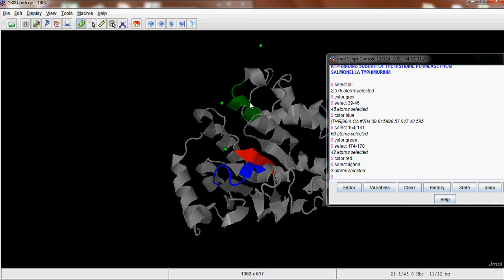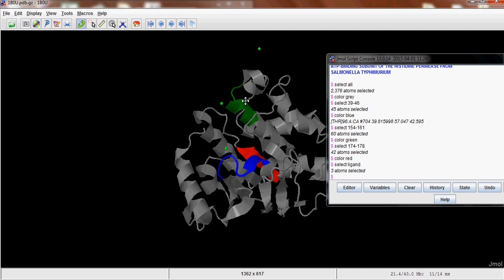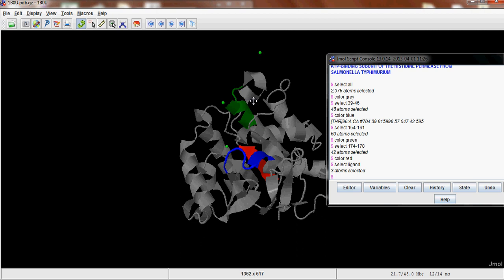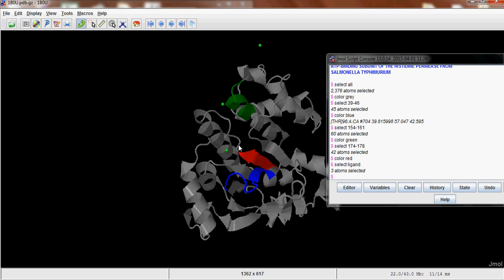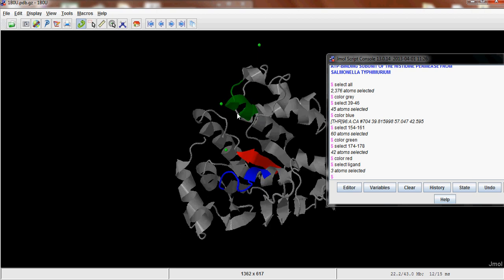So you can see the three green ATPs in your model. And you can then comment on how close they are to these. So you can see there's one close to the red domain, one close to the green domain. And this one's kind of far off. So there's nothing really close to this blue one.